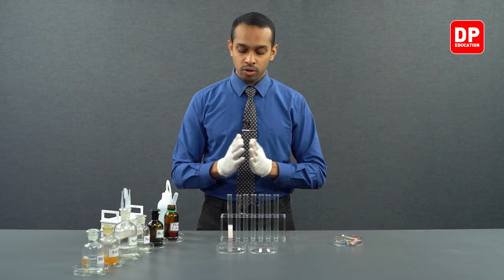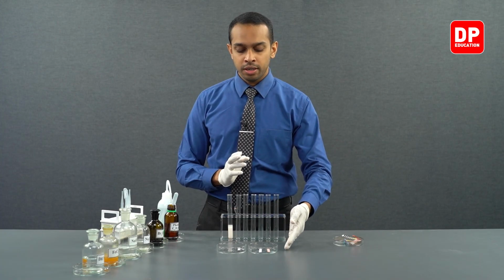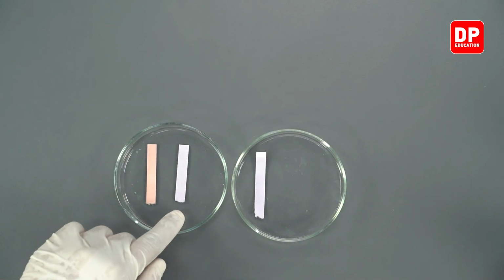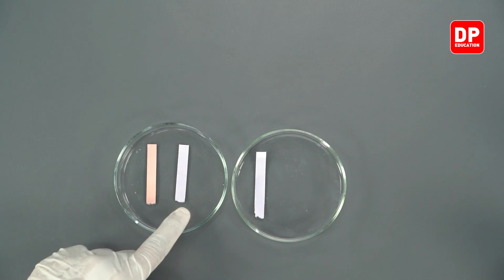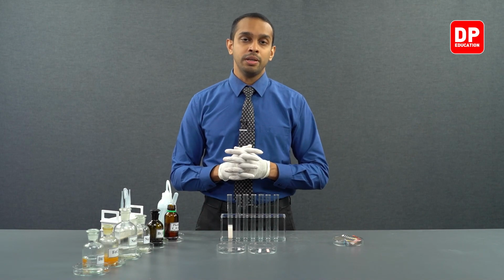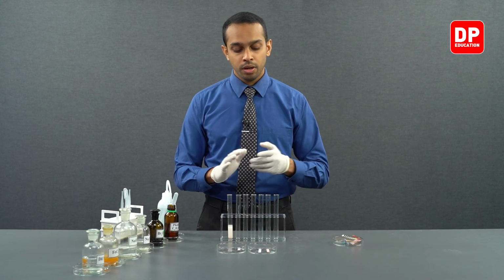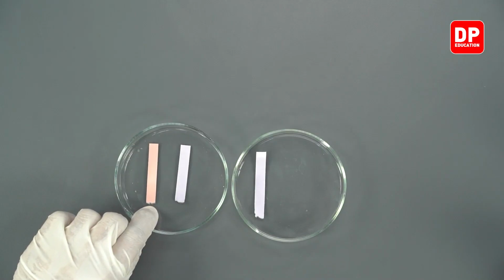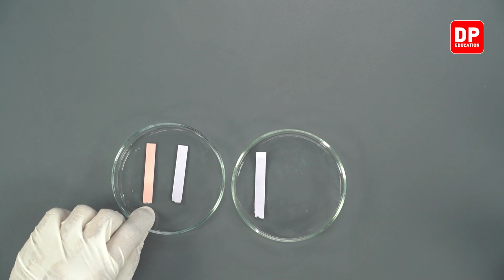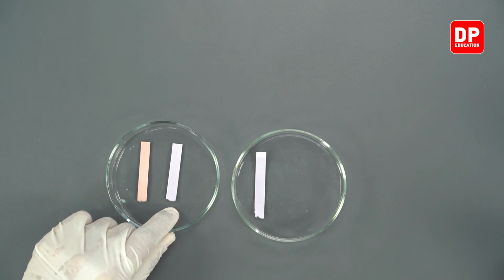In this part of the experiment, we are going to see the acidity or the basicity of our phenol solution. In order to do that, we will be using a red litmus paper and a blue litmus paper. Later on, we will be using a pH paper to determine the pH value of this phenol solution. Red litmus paper will turn blue in the presence of a base. Blue litmus paper will turn red in the presence of an acid.